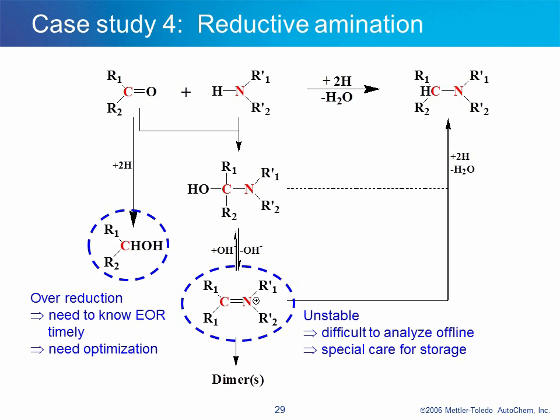Accurate detection of the hydrogenation endpoint is important in order to avoid overhydrogenation and the formation of impurities such as a dimer. FTIR monitoring is preferred to the conventional hydrogen uptake monitoring since it provides component-specific information and is more sensitive to detect the onset of product degradation upon overhydrogenation. From the FTIR data, once the amine is formed, it almost immediately will begin to degrade to form the dimer.